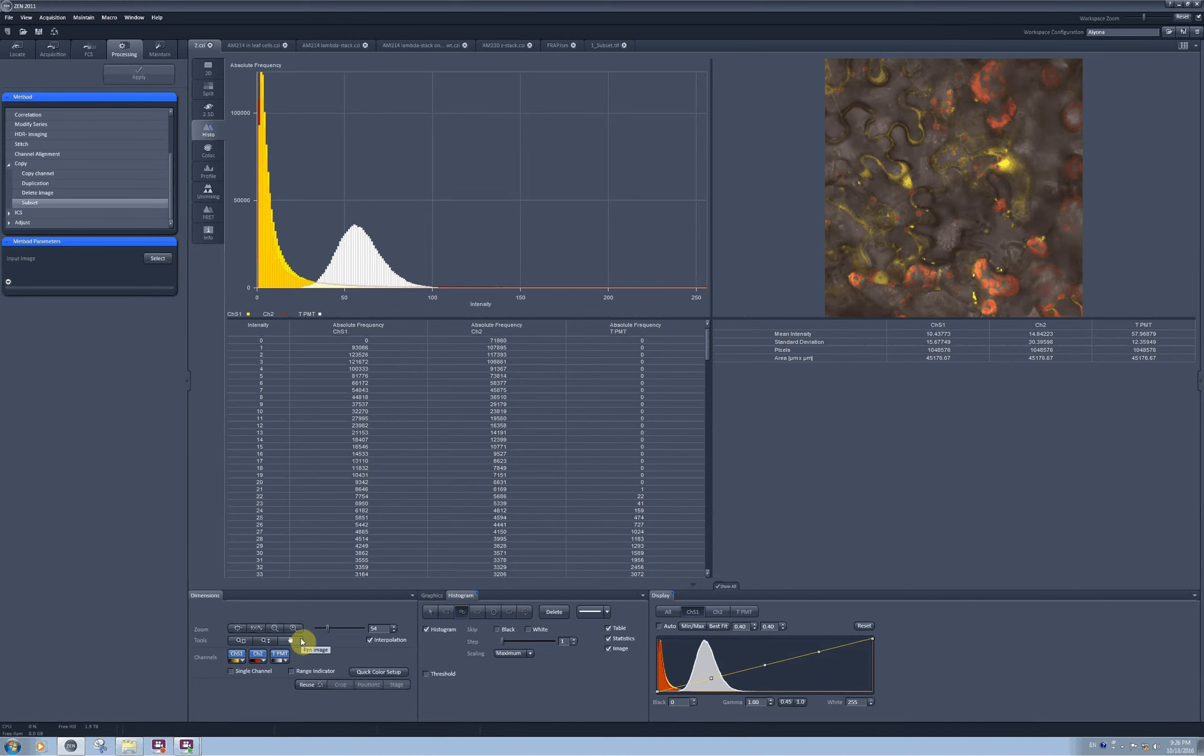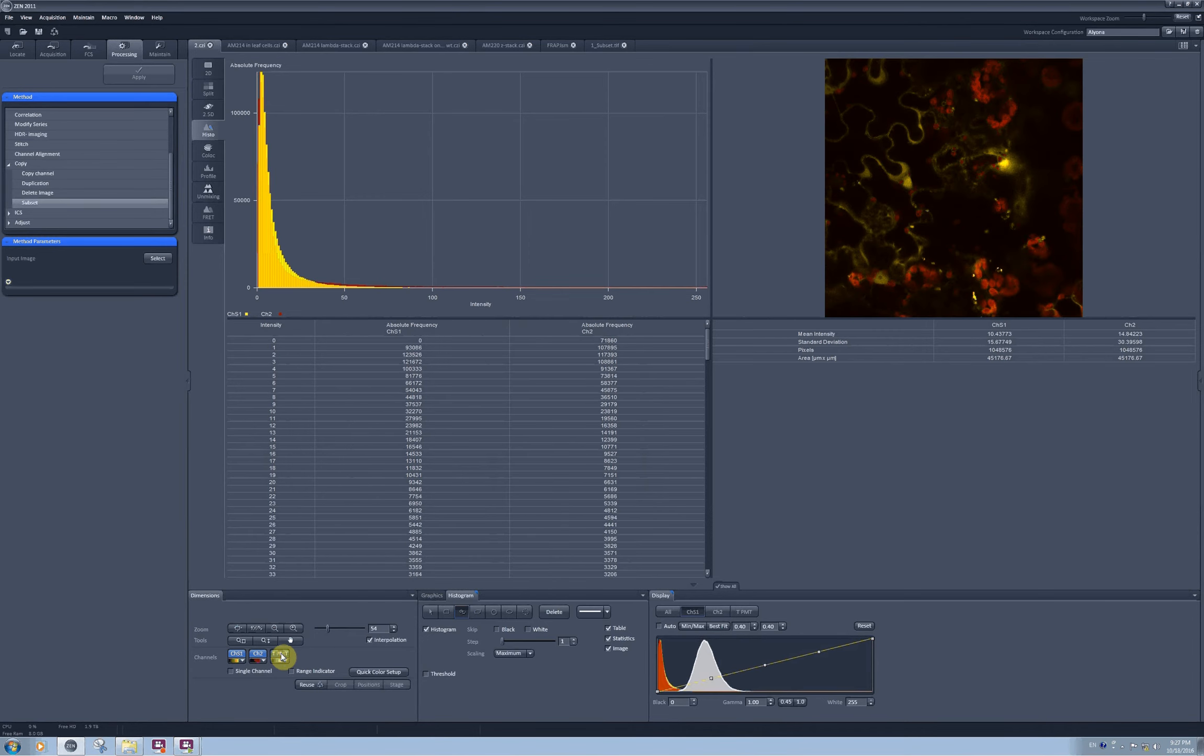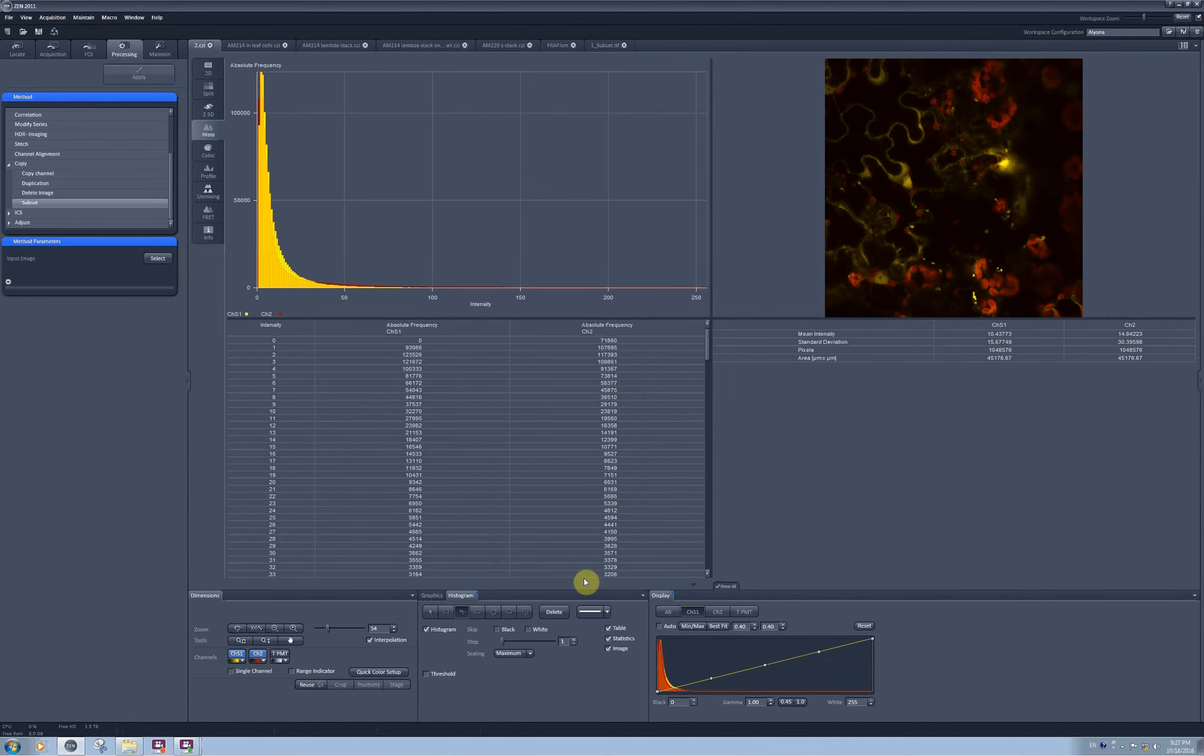If I don't want any channel to be included into quantification, for example TPMT doesn't make sense to quantify for intensities, I can deselect it and it disappears from the image, from the table and from the histogram. And also from the raw intensity data.